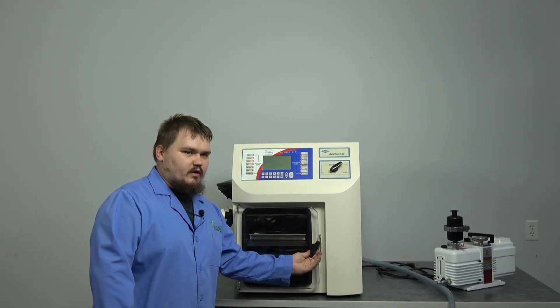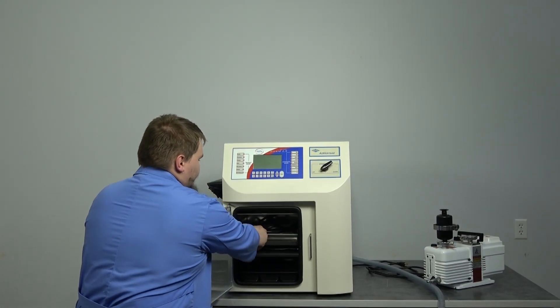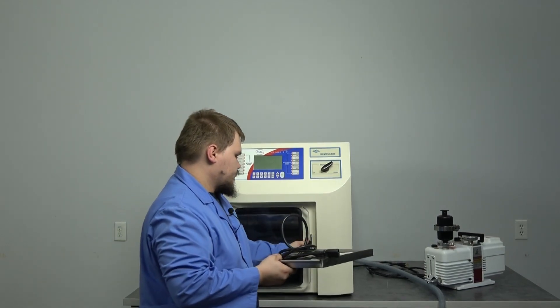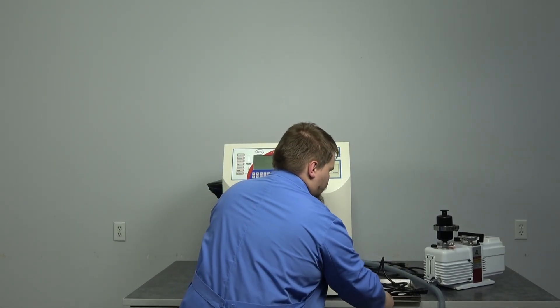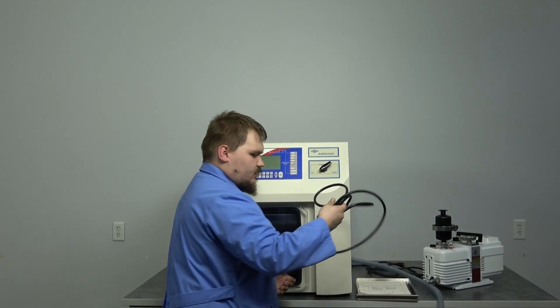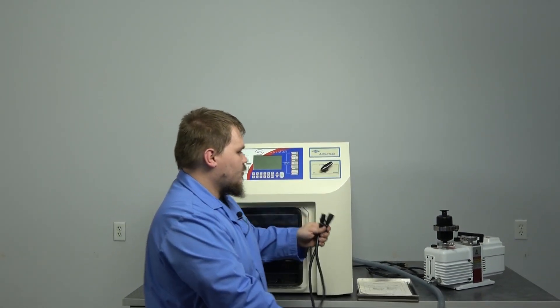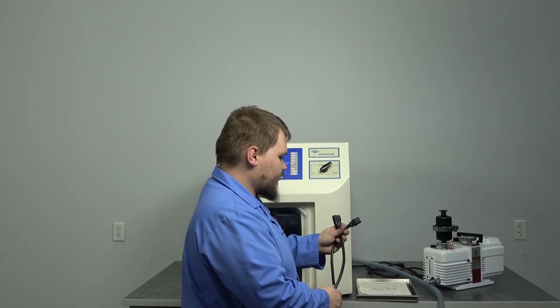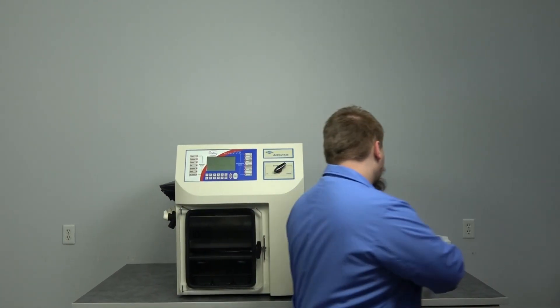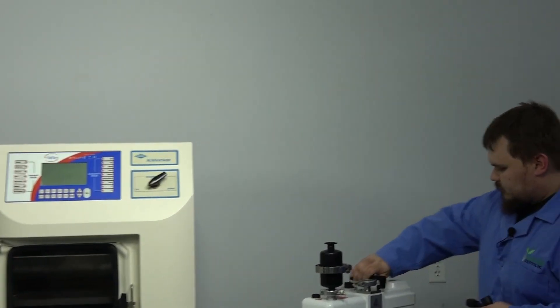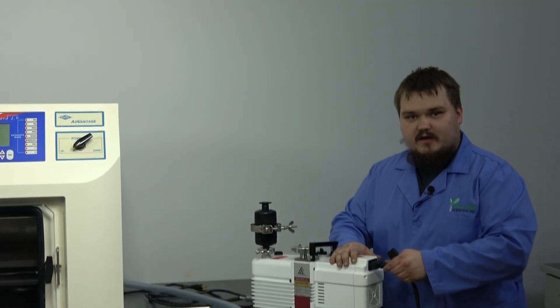First things first, we're going to pull out the items in the machine, and that's the power cord for the vacuum pump right here. We're going to put the cord on the vacuum pump, which connects up right here.